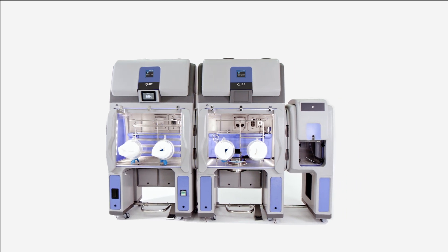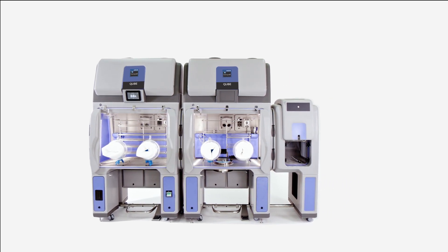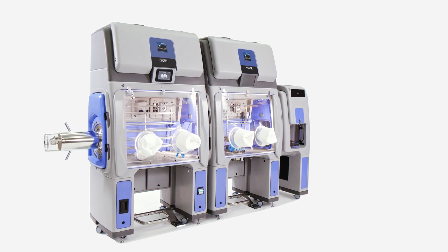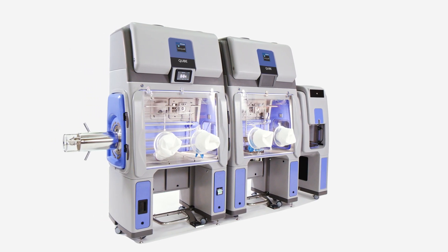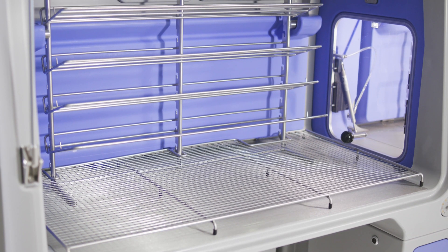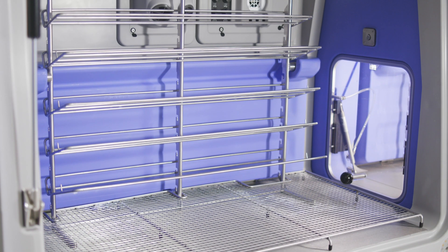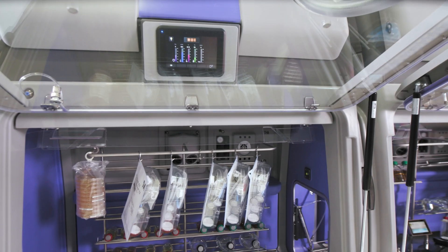Reliability and ease of implementation to your aseptic environment. Unlike traditional stainless steel isolators, the BioQuell Cube system is modular and made from molded polypropylene, offering distinct tangible benefits. Because of its manufactured method, production of the system is quicker.